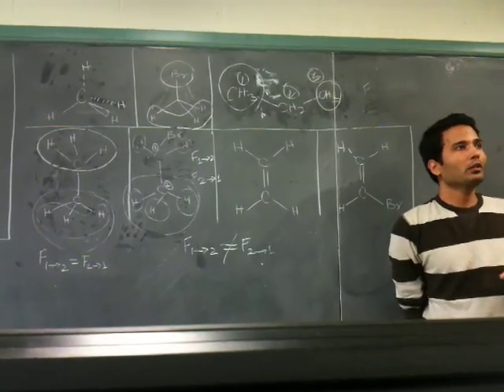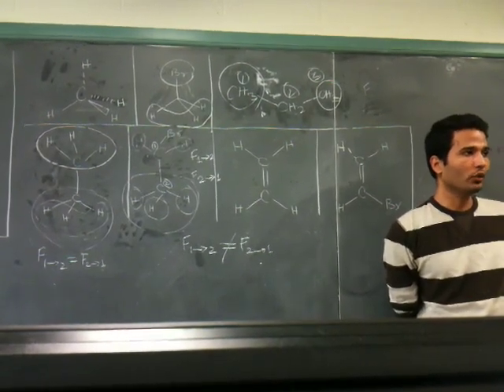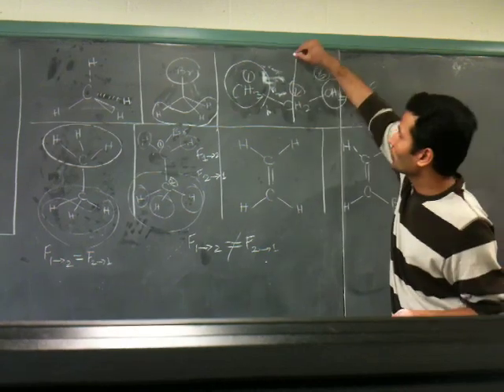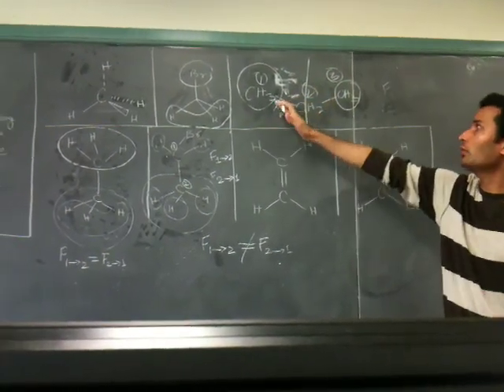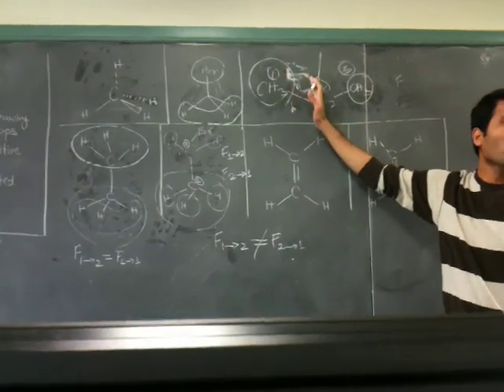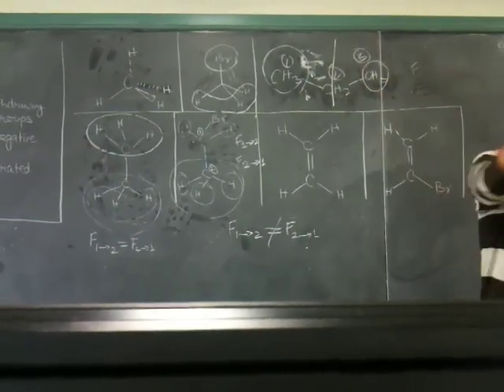In these examples, rather than talking about electronegativity, we talk about the symmetry of the molecule. If you look at this molecule, it is symmetric. You can cut it into 2 equal halves. So you will have the peaks for just 1 half, and the peak for the second half will overlap on each other.